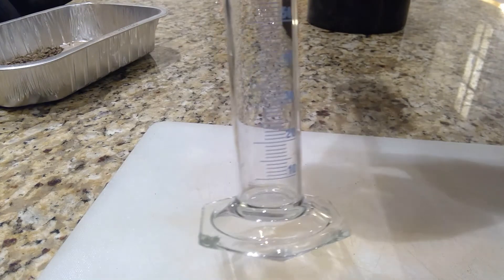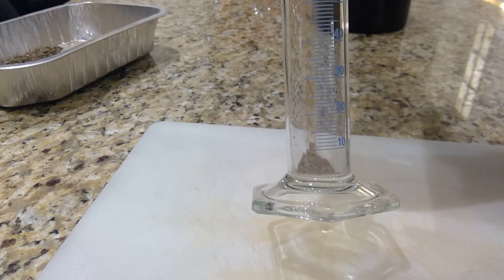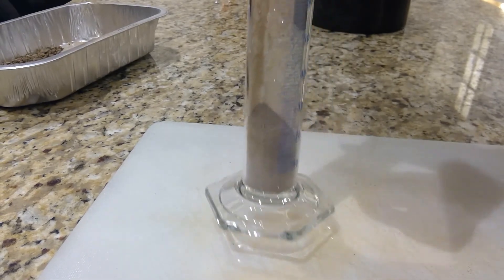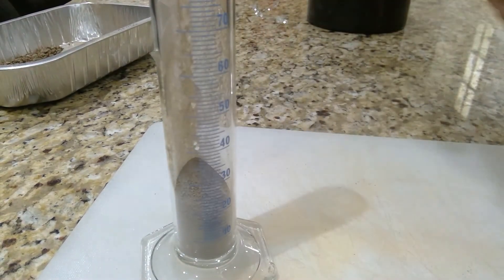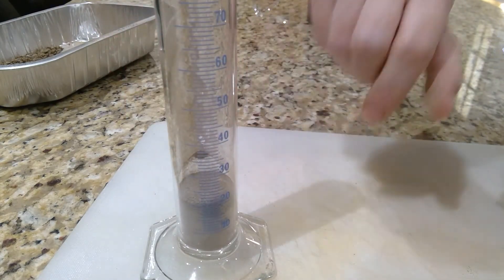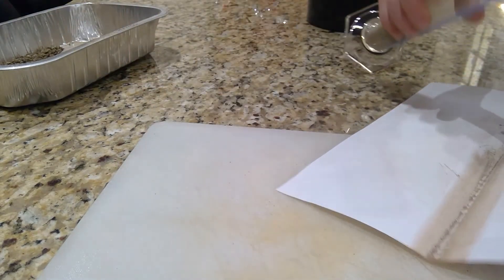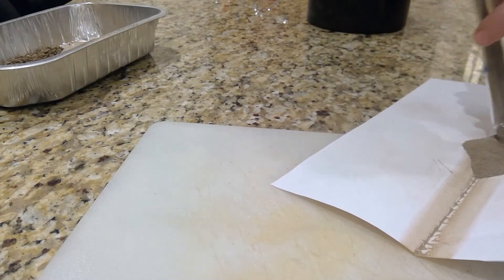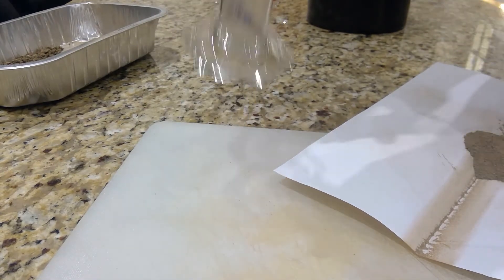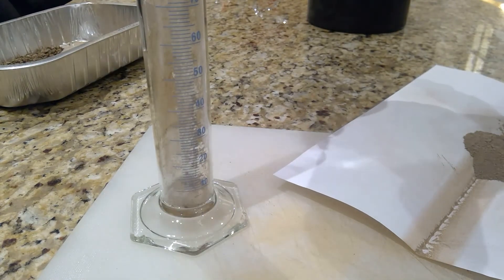I'm going to pour it into the graduated cylinder — it's nice and dry. My sample is just about up to the 20 mark. So I'm going to take the sample back out again and put about 60 mils of water in.